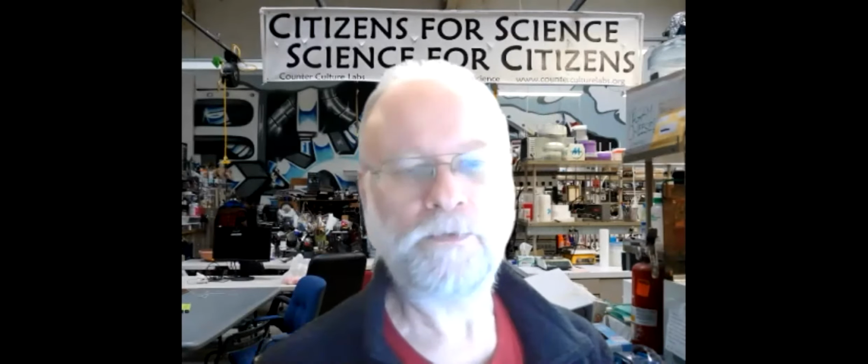We also have talked about automating the process a lot more, because right now somebody needs to essentially prep the plates and get them in the right location and all of that. If we had something like a plate robot that could take a pre-poured petri dish off a plate and put it in the right position for the robot, we could run through dozens of plates in a completely automated fashion.